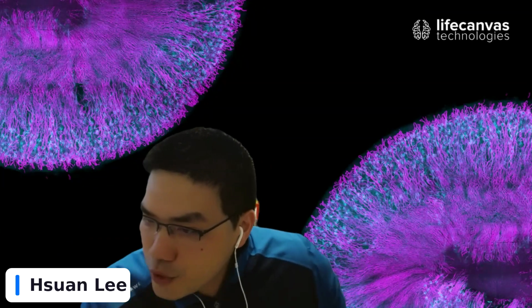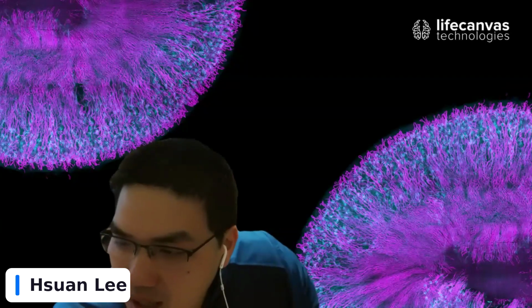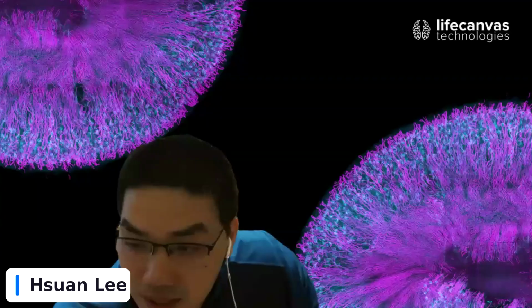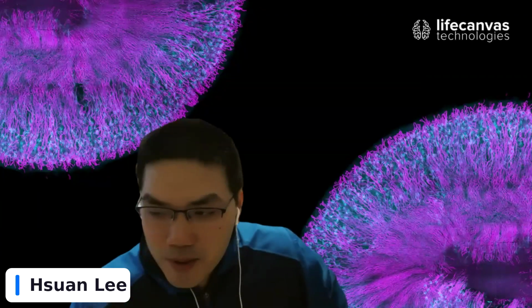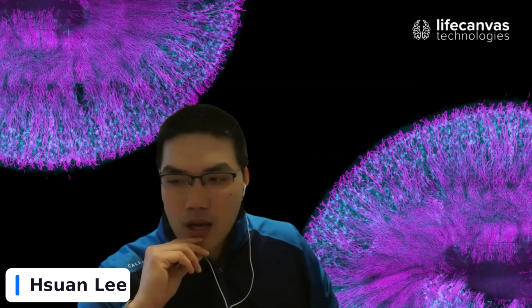And from James, very exciting. Does each objective use the same RI medium? How difficult is it to swap out the objectives? Yeah, so I already briefly mentioned the RI exchange.